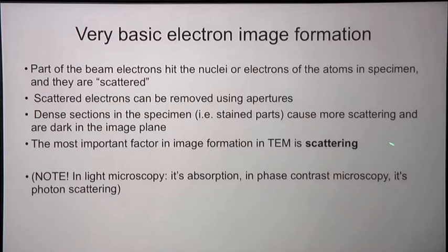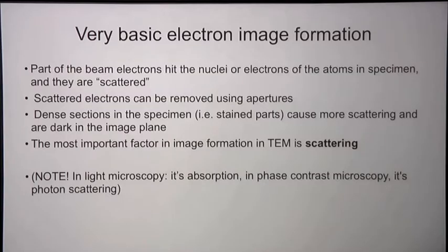So really, electron microscopes are all about scattering. And this is in contrast to some forms of light microscopy where we talk mostly about absorption and re-emission. Right? So in electron microscopes, the fundamental process is electron scattering with the sample. Okay.